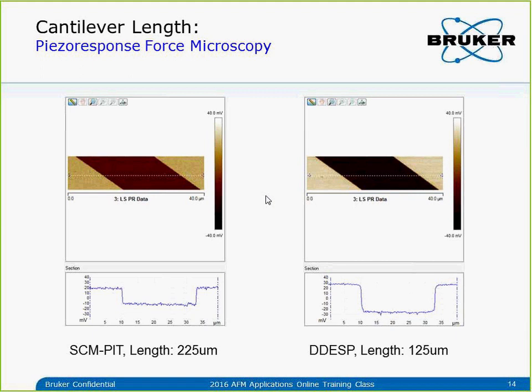The sample movement is very small, probably in the picometer range, and of course our tip needs to be conductive in this case. But in order to detect a picometer movement of the sample, especially in the vertical, the cantilever needs to be really sensitive. We need very good cantilever sensitivity to detect that small change in the sample size in the vertical.